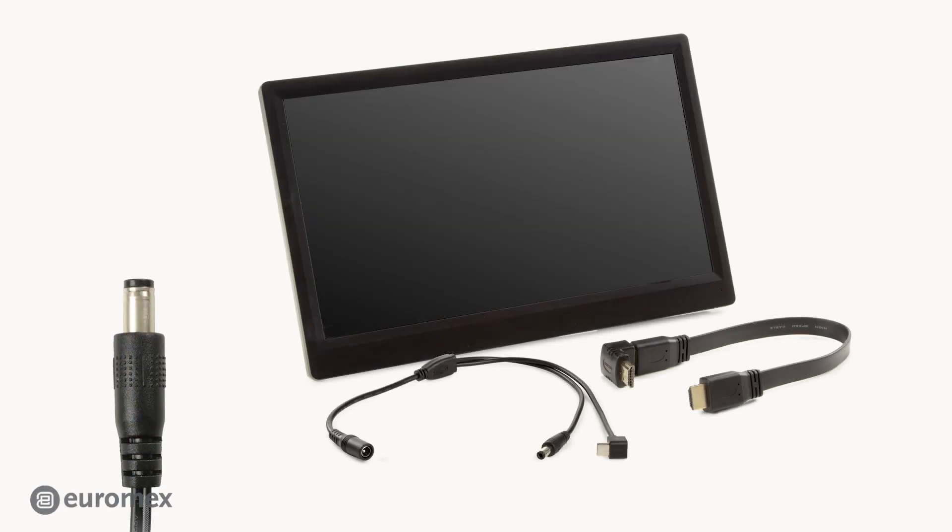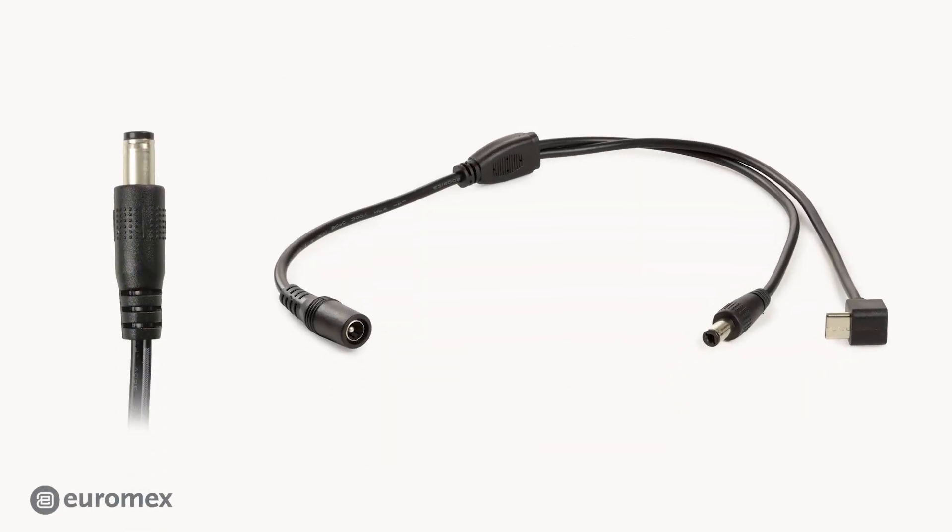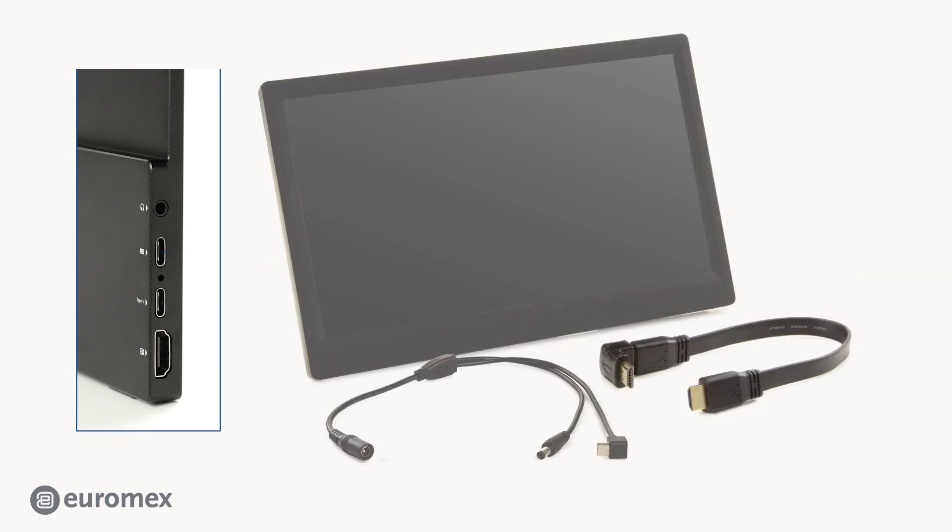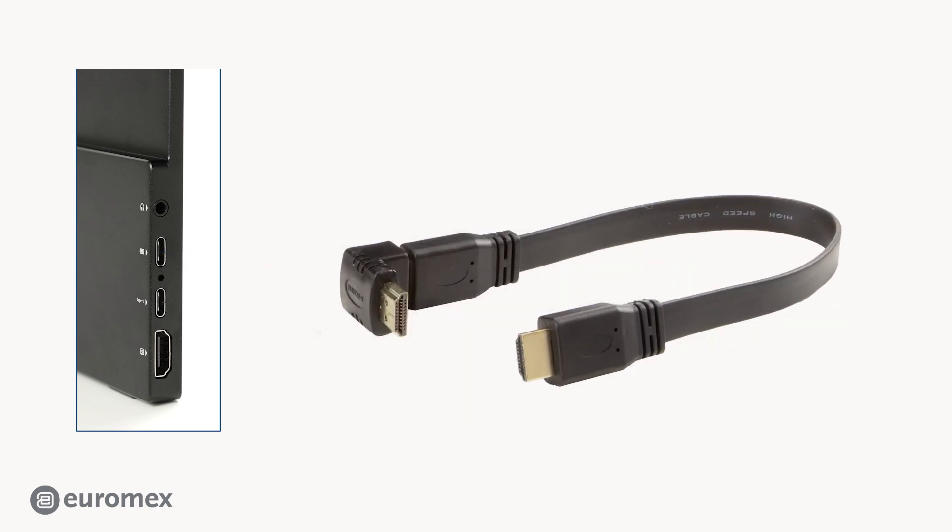Let's start with the power adapter. Use the Y-cable to connect with the power adapter. Use the USB-C plug to connect to the screen. Plug the HDMI connection into the screen. The other side connects to your camera.